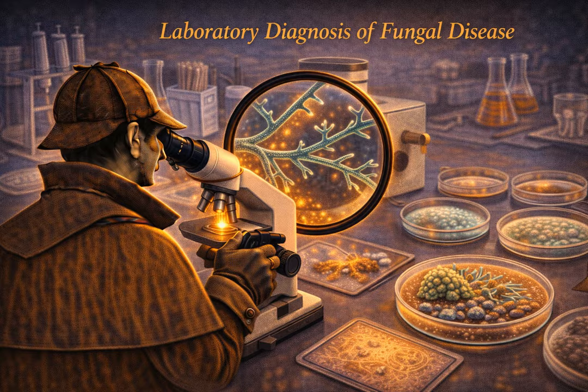Now, what about the gram stain? I always associate gram staining strictly with bacteria. Purple for positive, pink for negative. Does it actually work on fungi? It's the absolute bread and butter of the microlab, so literally every specimen gets gram-stained eventually. And yes, it does work, but you have to know what you're looking for.